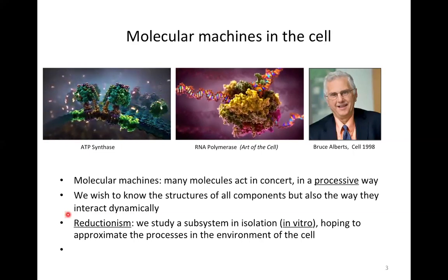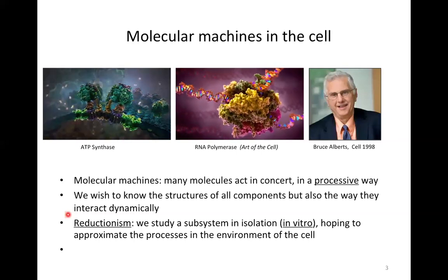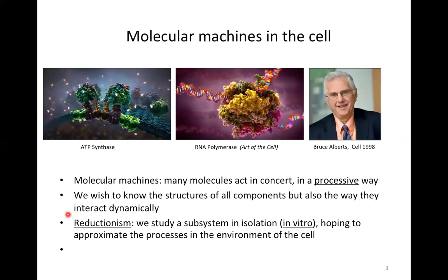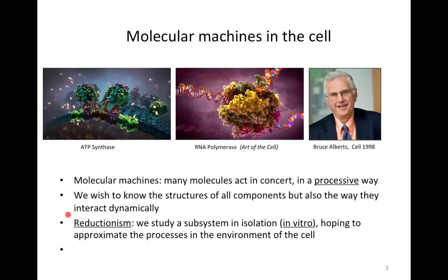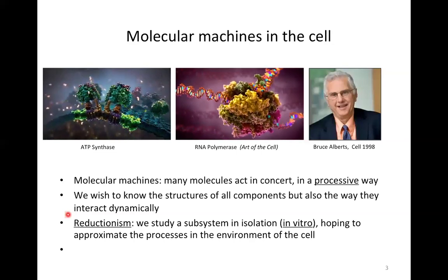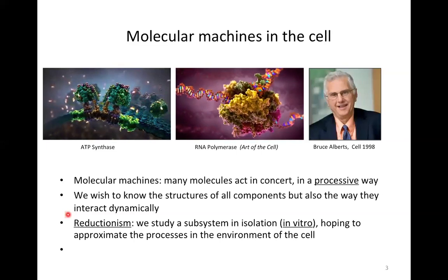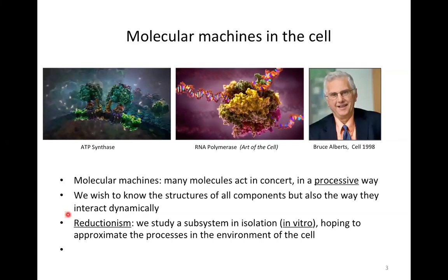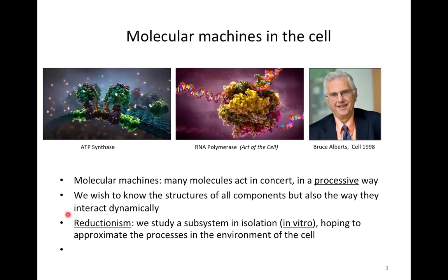In many cases, it is actually possible to look at a molecular machine in vitro by providing all components and all energy supplying entities. So we can essentially follow a very particular process outside of the context of the cell. So reductionism is really underlying our entire approach.